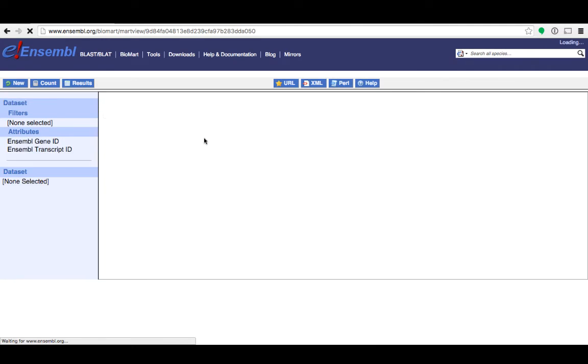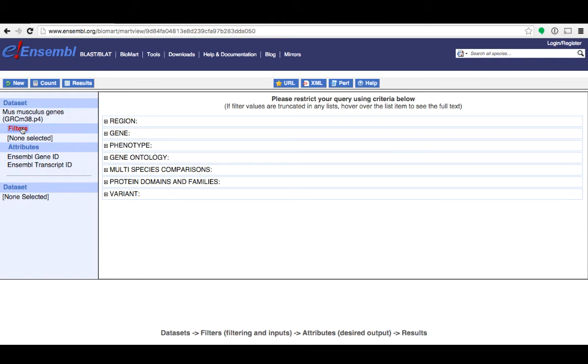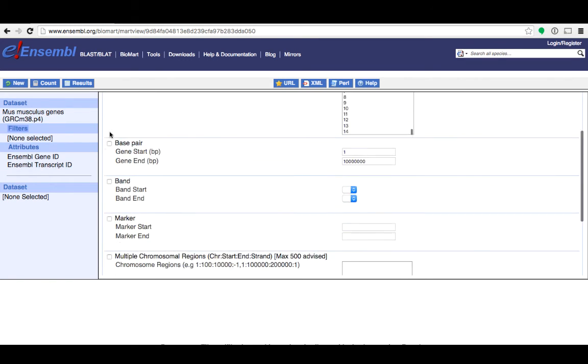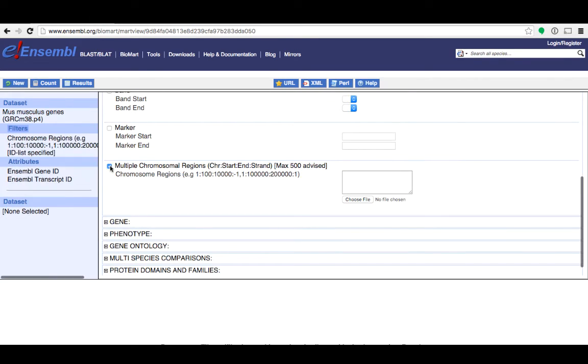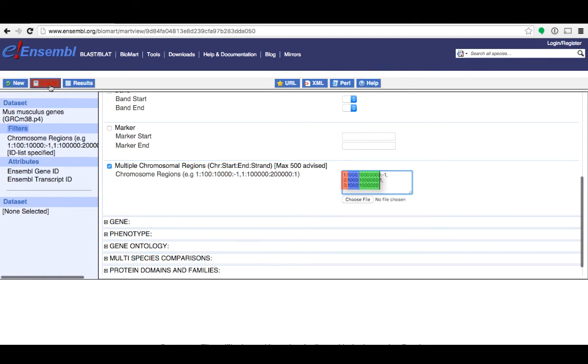Then I'll choose genes and the mouse genome as my database and data set. For my filters I'll expand the region option to see what we have there. You can filter your data to within a specific chromosome or pick a range of coordinates to search within. I'm going to paste my coordinates into this box here. These numbers here are genomic coordinates. The first number is the chromosome number followed by the start coordinate and then the end coordinate. If you want to specify which strand you can add 1, minus 1 or leave it empty for both strands.